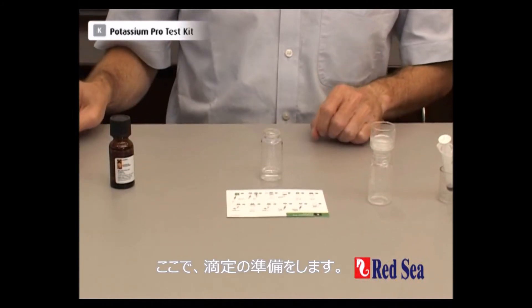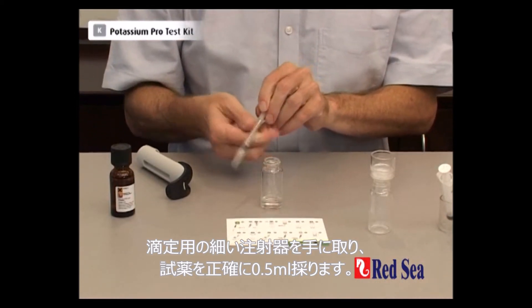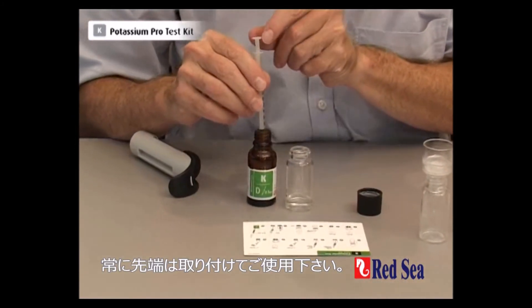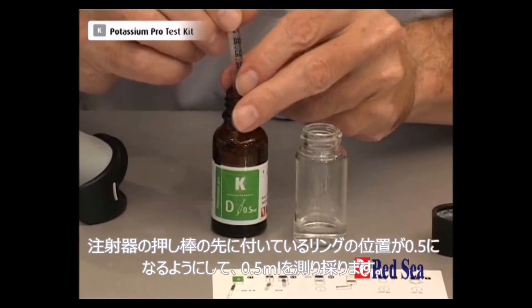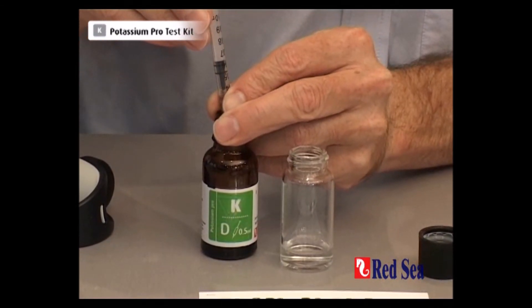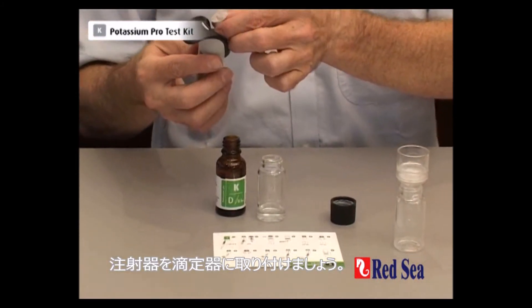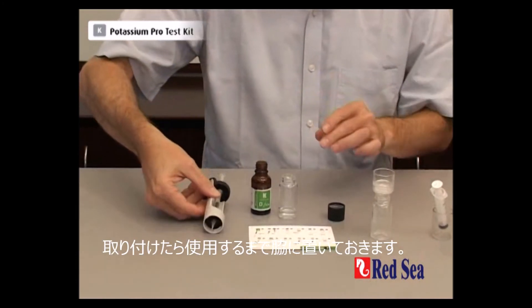The next thing we have to do is get our titrant ready. We take our titration syringe and we're going to take exactly 0.5ml of titrant into the syringe. Remember to keep the tip in the liquid at all times — we're measuring the 0.5ml with the bottom of the plunger. There we have the plunger at 0.5ml. Let's put the syringe into the titrator and put it to one side until we're ready to use it.